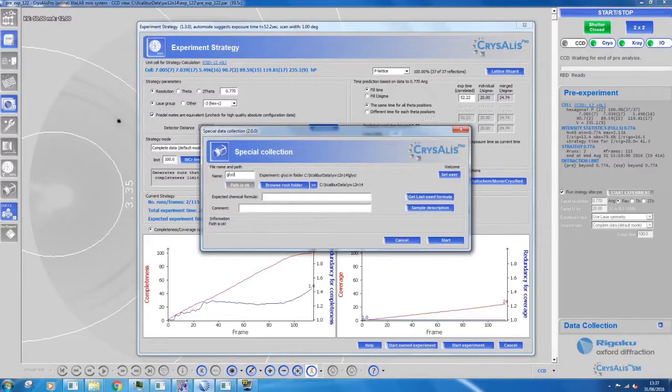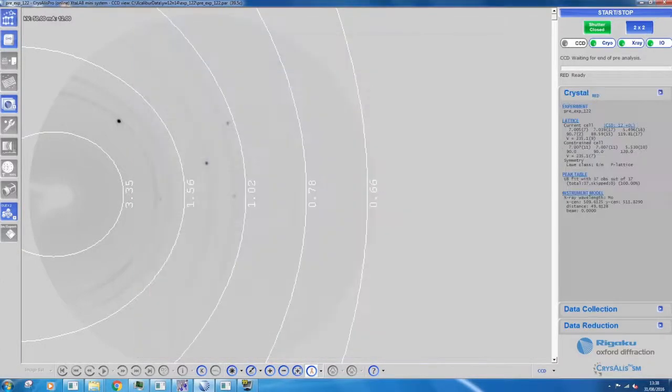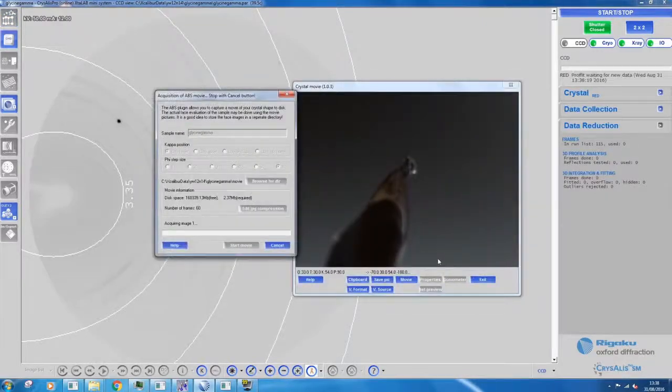Enter your sample name and chemical formula. Choose a directory to save your results. Edit your sample description and press start. The instrument will now automatically begin to collect your data, after which the data will be ready to analyze. You should now be able to collect your own single crystal data using a XtalLAB mini.